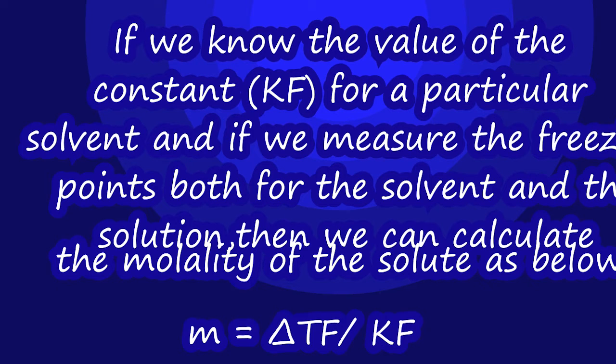So we find the freezing point for the solvent and the freezing point for the solution, and you subtract to get delta TF. Kf is a given number, a constant, the molar freezing point depression constant. This depends on the substance you are using. If you are using benzophenone, this number is going to be 9.80. A different substance is going to have a different value. For the purpose of this experiment, we are using benzophenone as the solvent. The value for Kf is 9.80 degrees Celsius per molal.